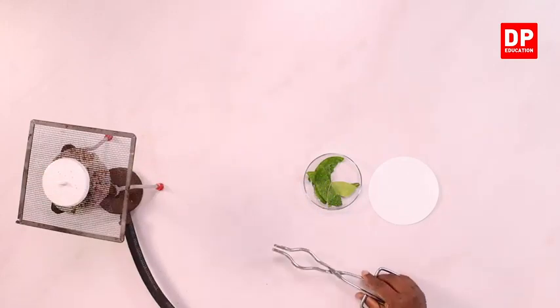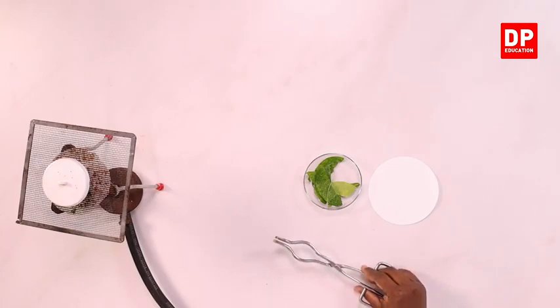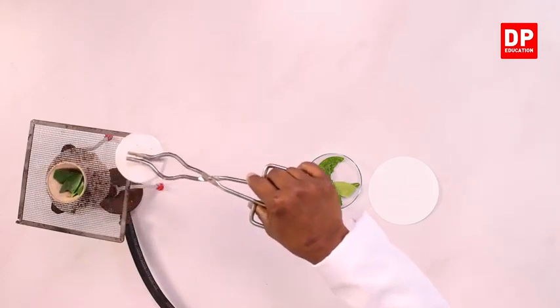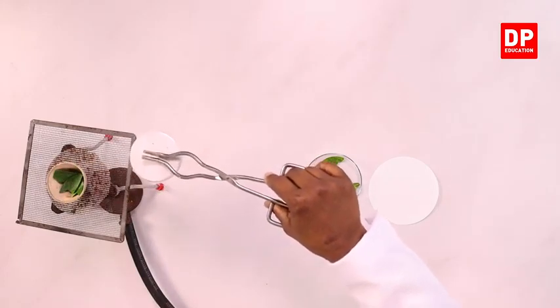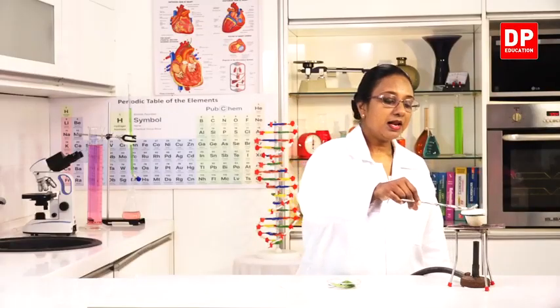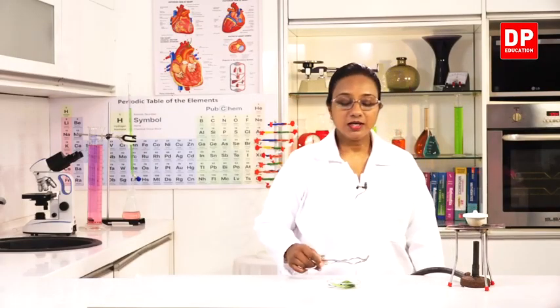Leave it for some time. Again I have to remove the lid and allow the water vapor to escape from the crucible. Like this, we have to keep on heating it until there is a change in the substance.